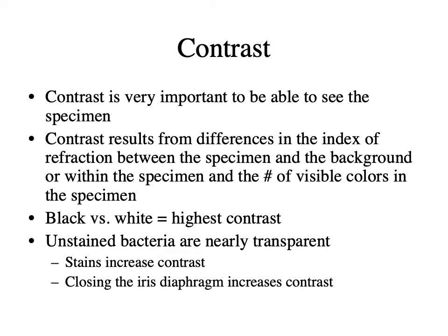Contrast is very important to be able to see a specimen. Unfortunately, bacteria that's unstained is nearly transparent, so you have to stain it to create contrast so your eyes will be able to see it when you're looking through the microscope.